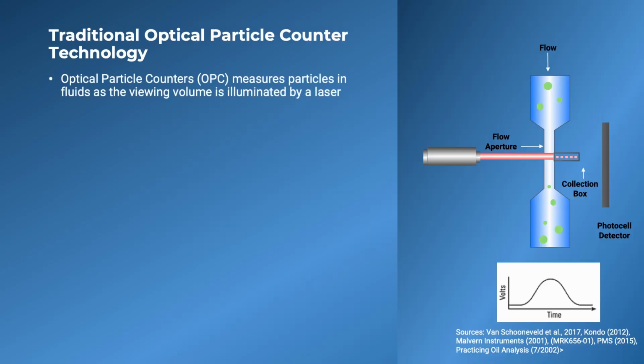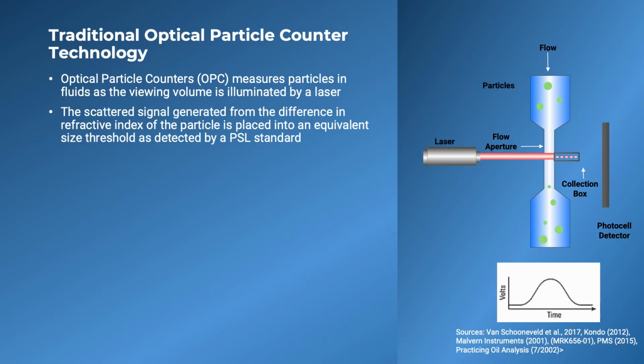Traditional optical particle counters, or OPCs, have fundamental limitations. They rely on laser light scattering, detecting particles only when the refractive index contrast produces enough scattered light to register a signal. However, as particle diameter approaches 20 nanometers, the scattering intensity drops to nearly zero. This means OPCs cannot detect the smallest, yield-killing precursors dissolved in the liquid.